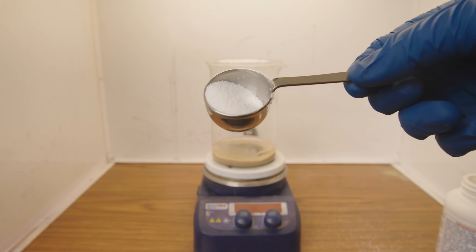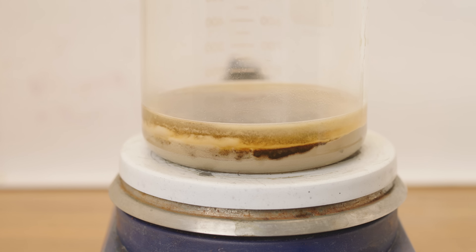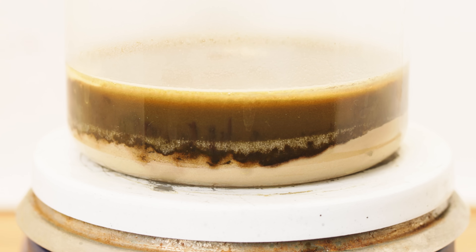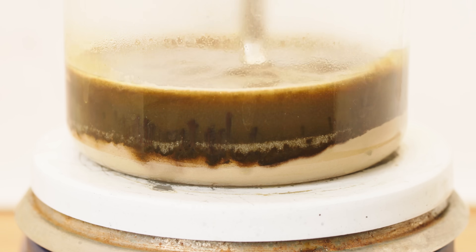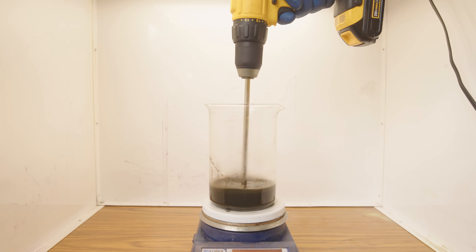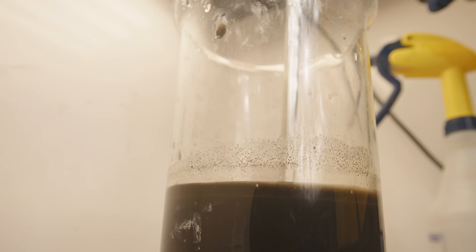This conversion happens with the addition of sodium hydroxide. The result is an exothermic reaction that generates a lot of heat. It's imperative to thoroughly mix in the sodium hydroxide, so I improvised by using an allen wrench attached to my cordless drill. I keep adding sodium hydroxide and mixing it until there is no more trace of the white silver chloride.